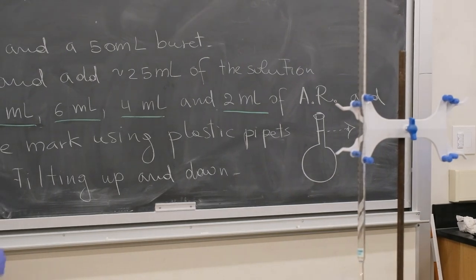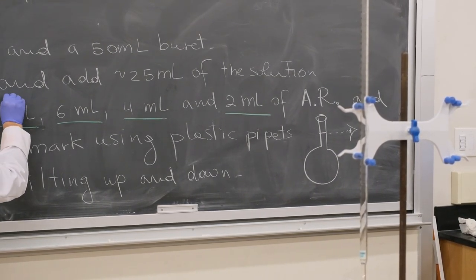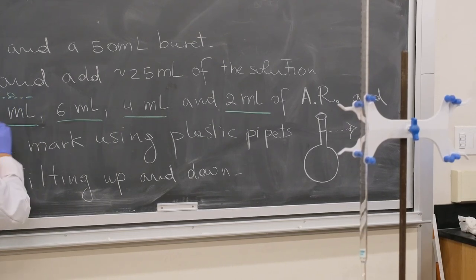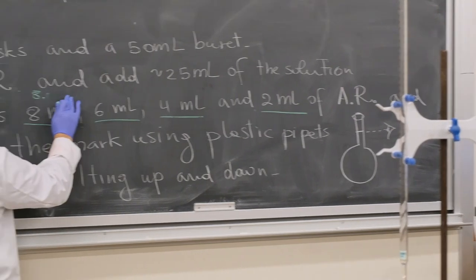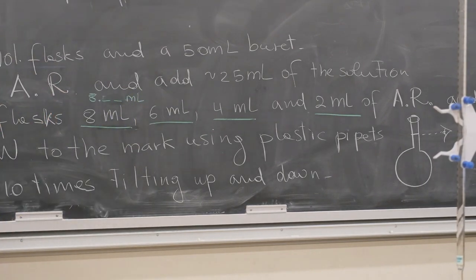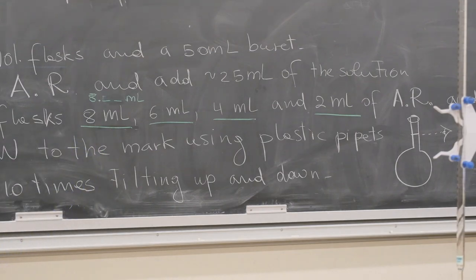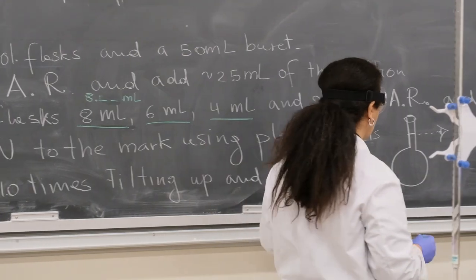So it's going to be 8 point, and then whatever number you're reading. You have to have two significant figures after the decimal point. Okay, so three significant figures total. And then you're going to add to each volumetric flask the deionized water to the mark. We learned how to do that, right?